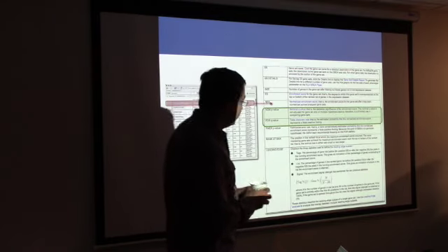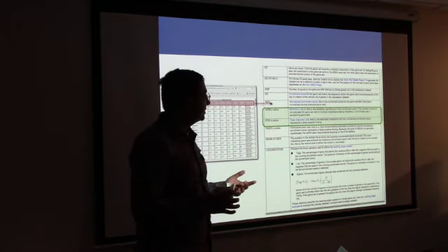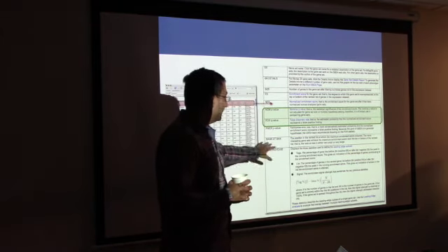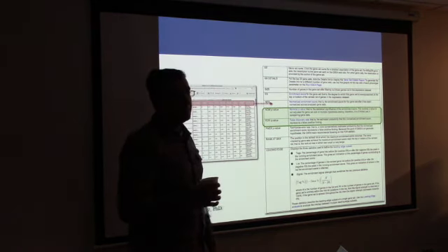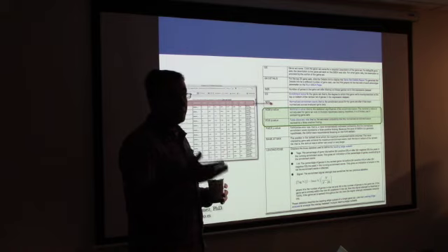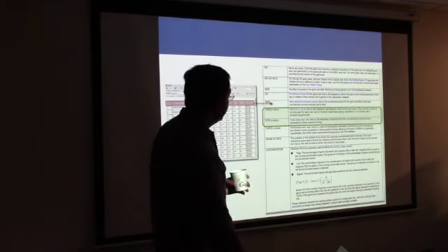So I would suggest reading all this again. I don't want to go into detail of everything because that's just going to take too much time. But that said, look at the normalized enrichment score, and then some of the other things here are interesting. I find this leading edge score very interesting because to me that seems to be a good marker of how your gene set compares to other gene sets. So for example, if your leading edge score is 80% versus some other gene set that has 20%, then obviously I'm going to look at the 80% one in this case.